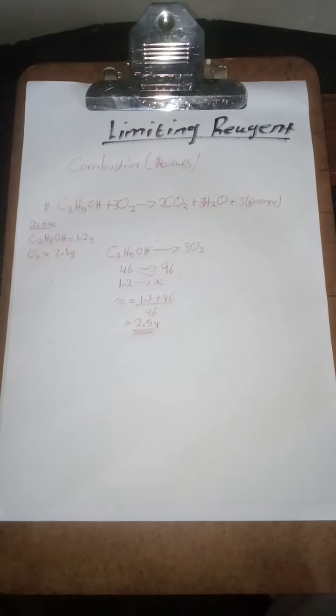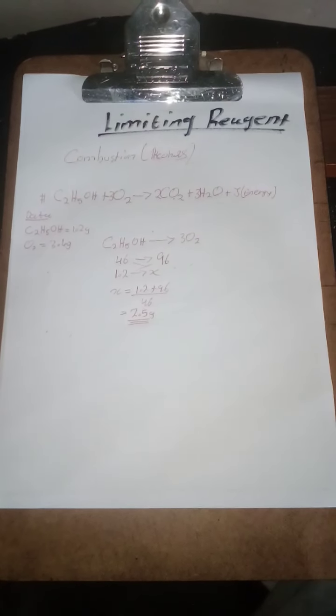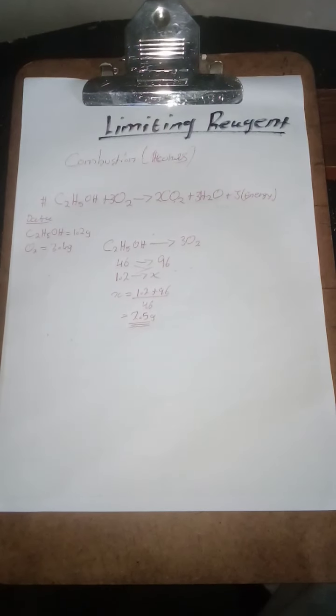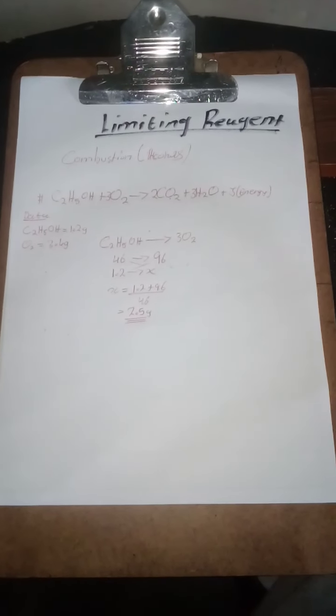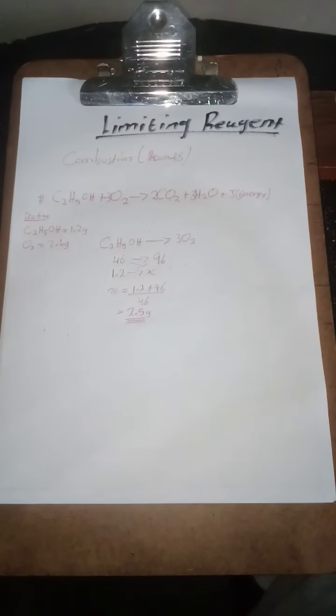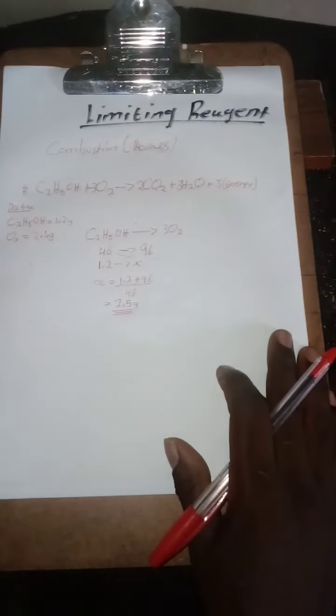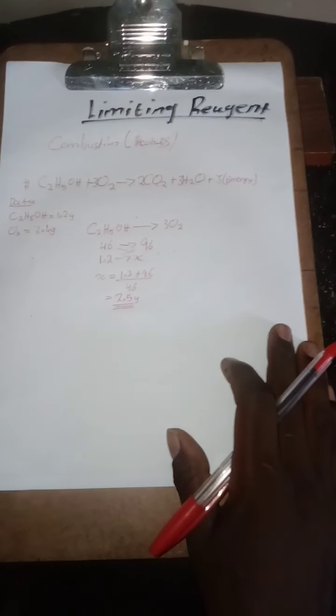Okay, so in this video we're going to focus our attention on chemistry. That is stoichiometry, limiting reagent. I believe if you have done chemistry, you have come across this. This is just a simple theoretical point of view. The most interesting part is us seeing things from the practical point of view.